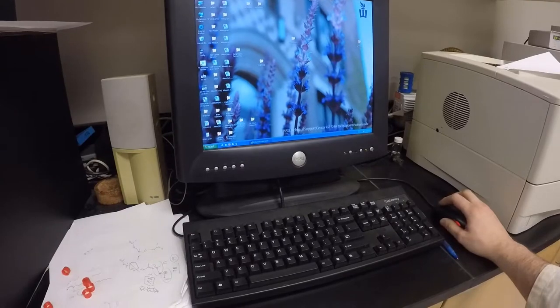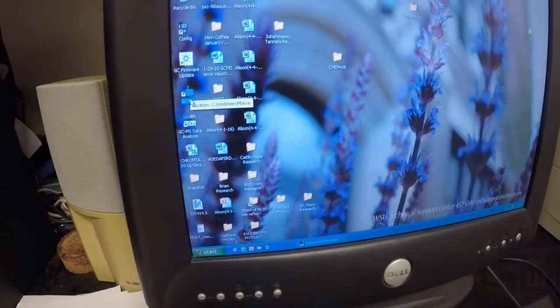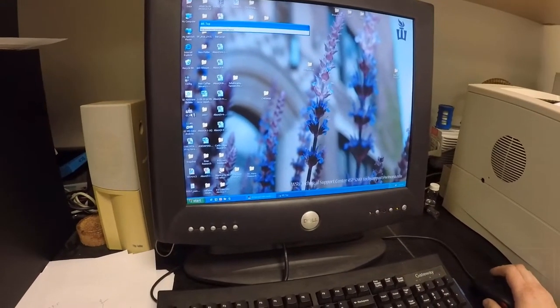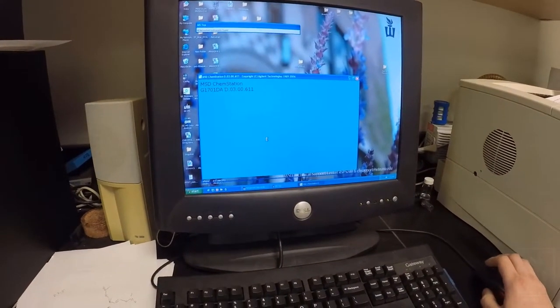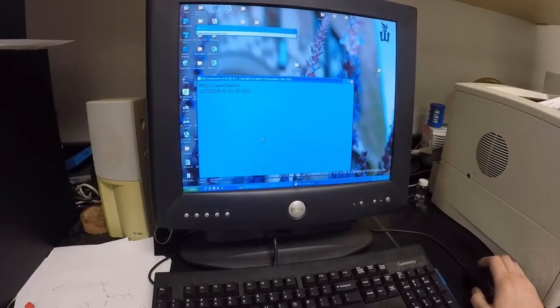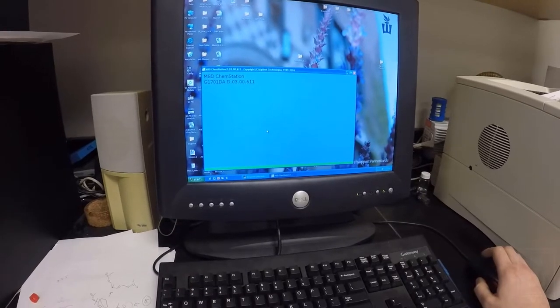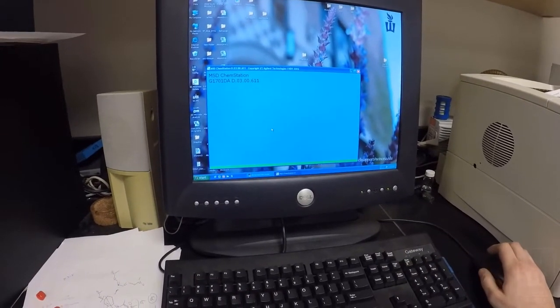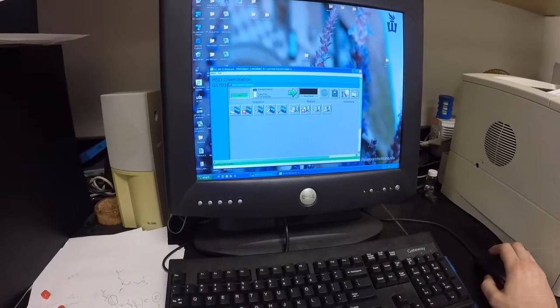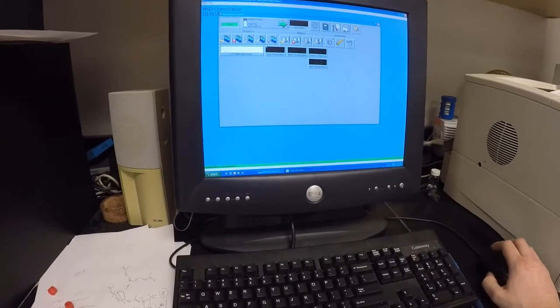So if you're in here, you want to go to GC-MS, which is right over here. GC-MS. Double click that. That'll bring up the GC-MS controller, and it's going to be on whatever settings the last person to run it was using.